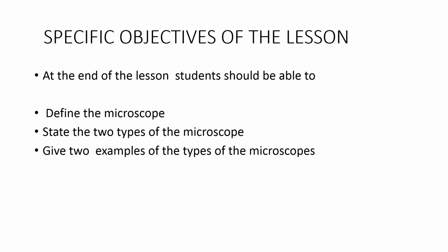We are going to be guided by these objectives so that at the end of the lesson we will know whether we'll be able to define what microscope is and state the different types of microscopes that we have.